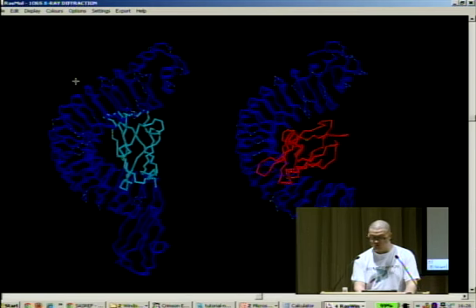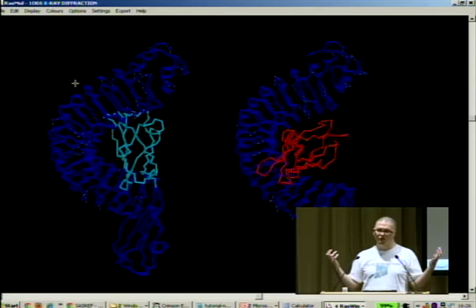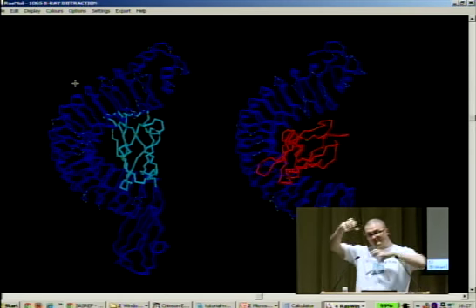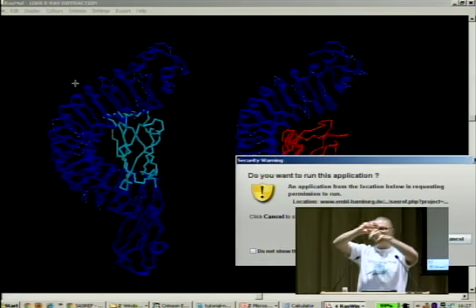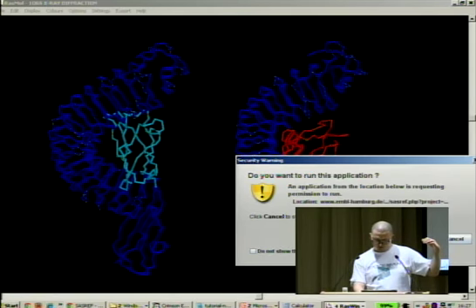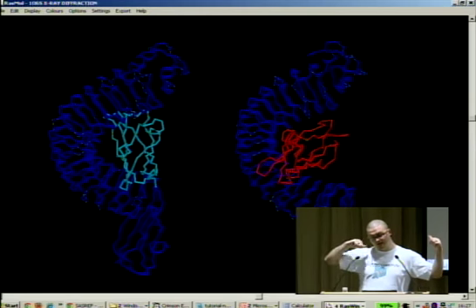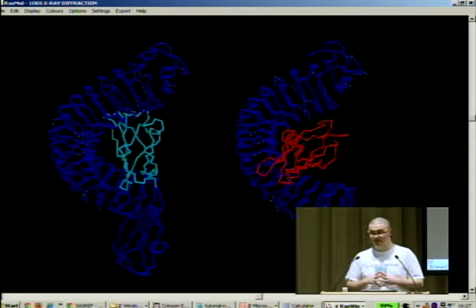So as you can see, the overall result is not entirely incorrect, and this complex constructed by SAXS was constructed without any prior knowledge how the subunits should be oriented. So this superimposition was found by trial and error in a way that the scattering of the overall complex is fitting the experimental data. So the position of the subunit is actually correct. However, the orientation is not.